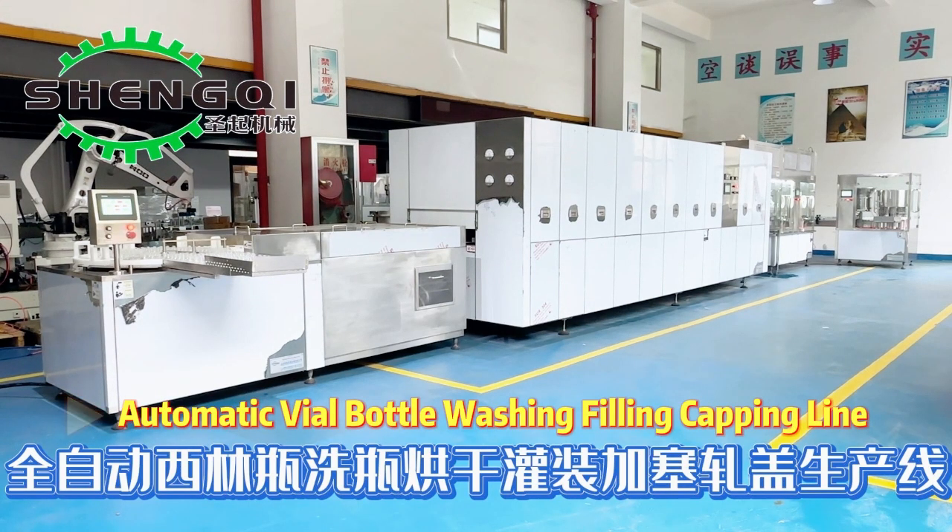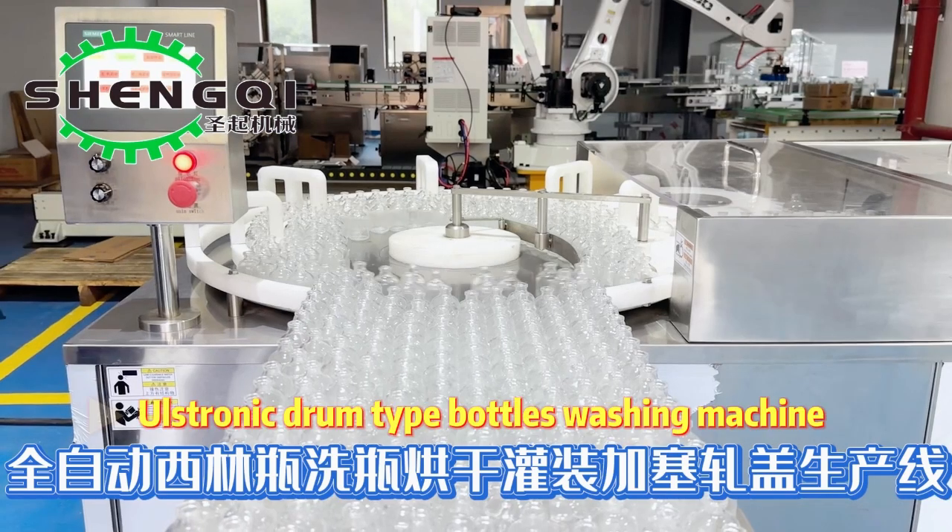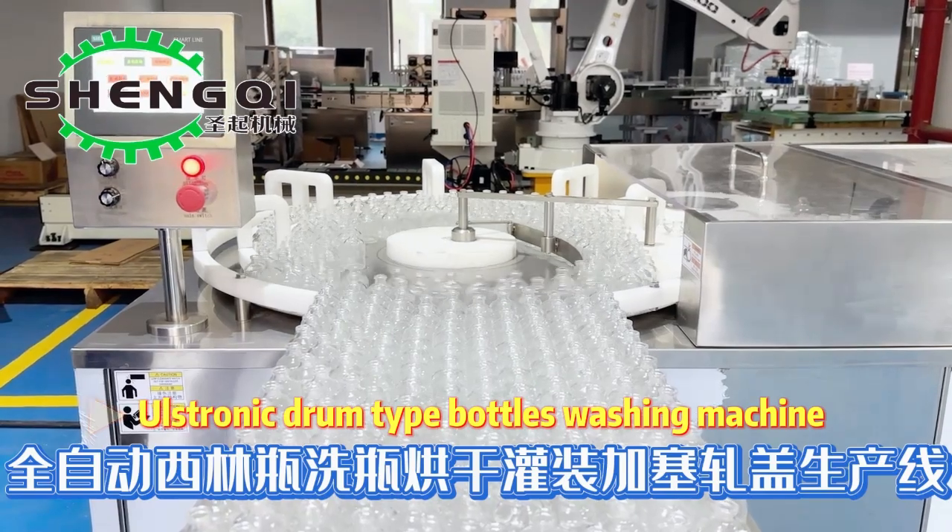Automatic vial bottle washing filling capping line. Ultrasonic drum type bottles washing machine.